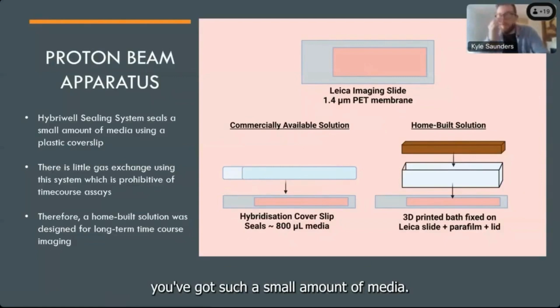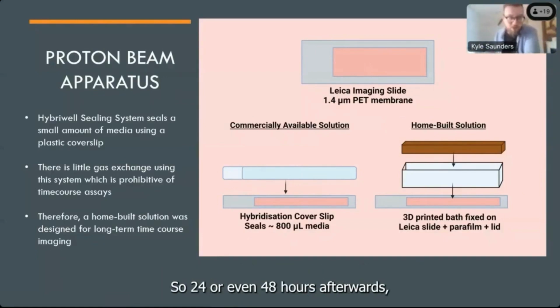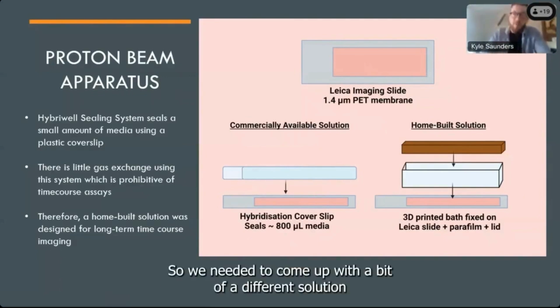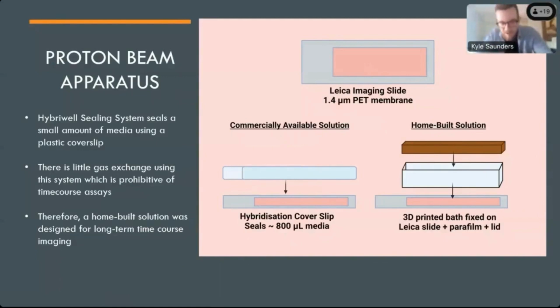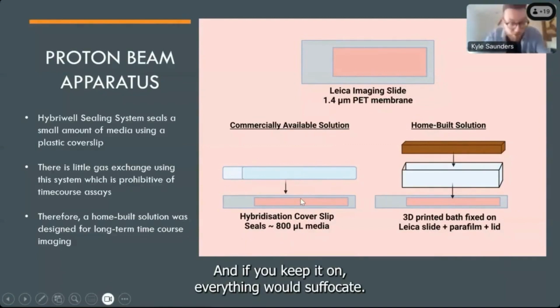You've got such a small amount of media, and what we were interested in doing is dosing our cells with proton beams and then doing quite a large time course study afterwards, so 24 or even 48 hours afterwards, to then pick out when we wanted to sample for mass spectrometry. So we needed to come up with a bit of a different solution that's going to allow the cells to have some gas exchange, because if you take this cover off for microscopy, for long-term imaging, everything will evaporate, and if you keep it on, everything will suffocate.